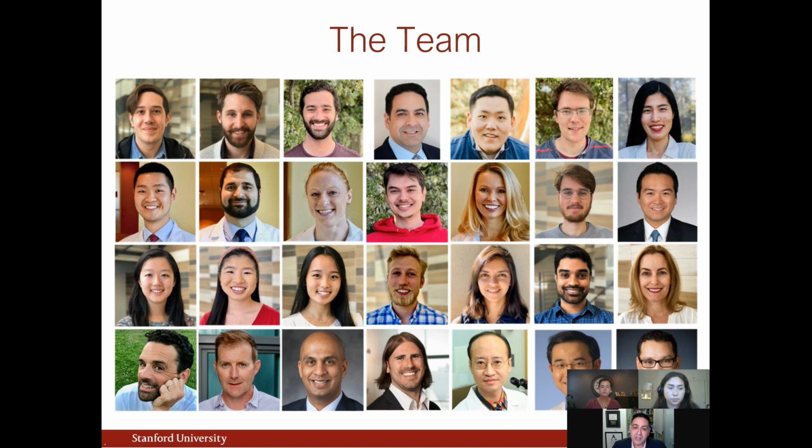And so you can choose your platform, and they all have their own strengths and weaknesses. It depends a little bit on the question you're trying to ask, and frequently we were using this a lot for discovery. Your validation experiments will sometimes use a different platform or different ways. So it depends on the question you're asking, the disease you're looking at, and how you're looking at it for selecting the different platforms. But they all have their own strengths and weaknesses.